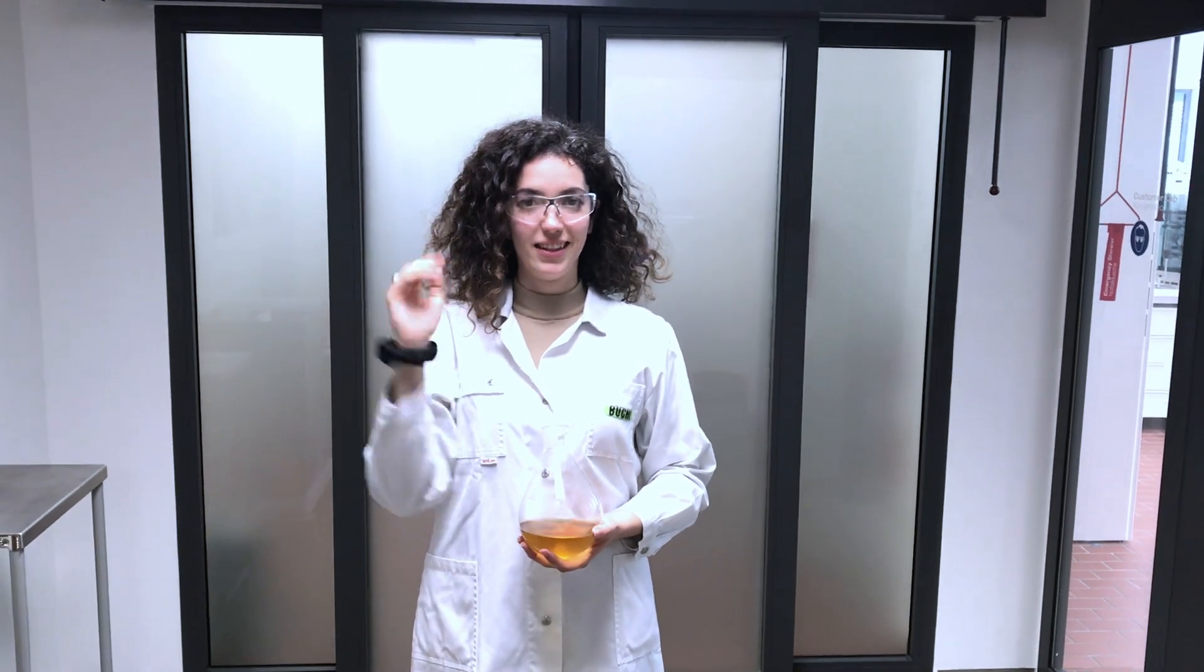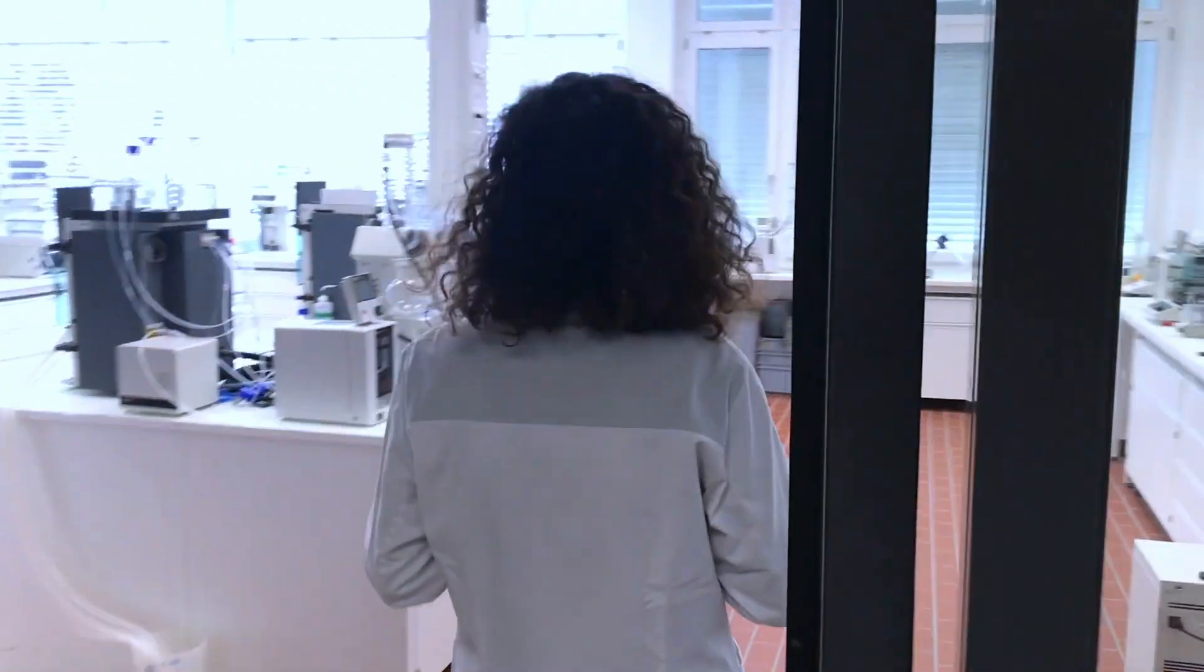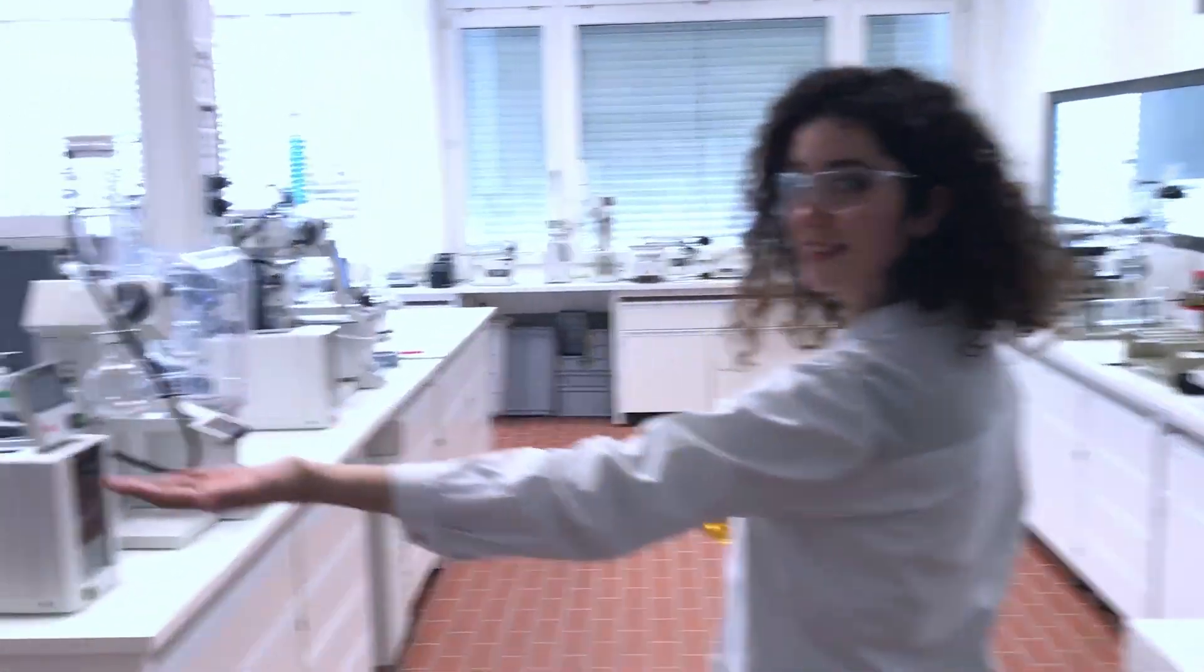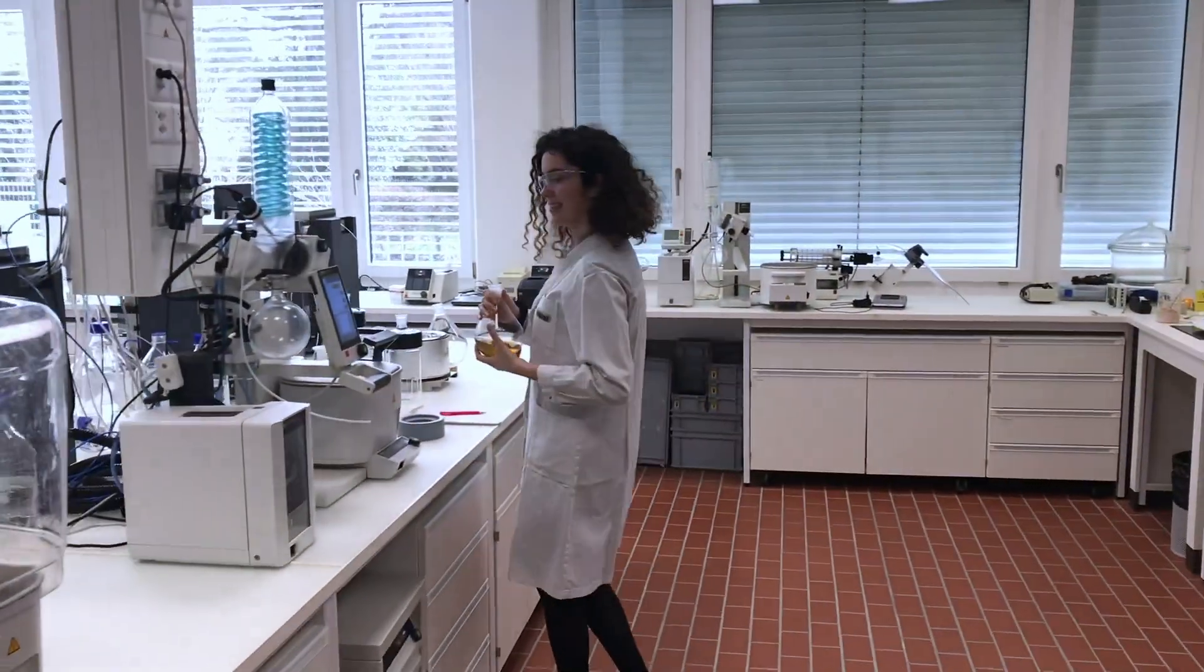Hello everyone! I am Tanina, the product specialist for lab evaporation, and I would like to welcome you today into our labs here in the headquarters in Switzerland. You can see all the systems there, but today we're going to focus on the rotavapor.